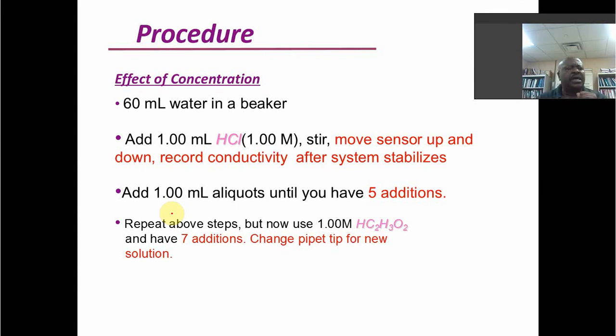You should get a small number. That indicates that the conductivity sensor is working fine. It's about 20 to 100 microsiemens per centimeter for our quality of distilled water. So that's what you get for the beaker. If you're getting something like 900, talk to your TA. First of all, rinse the sensor with water through the hole to make sure it's clean. Let it sit a little, kind of wake up from its slumber, and then test it again.